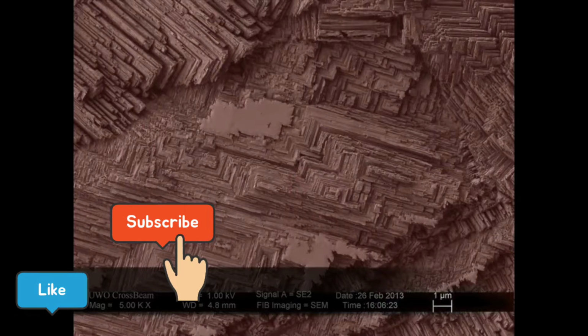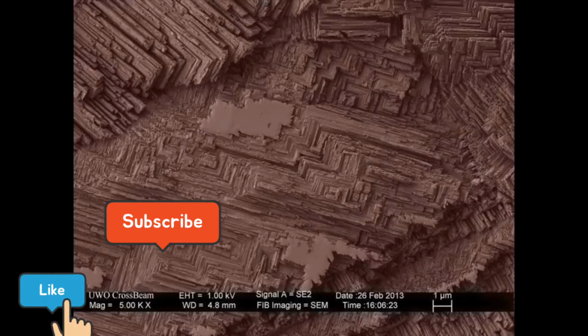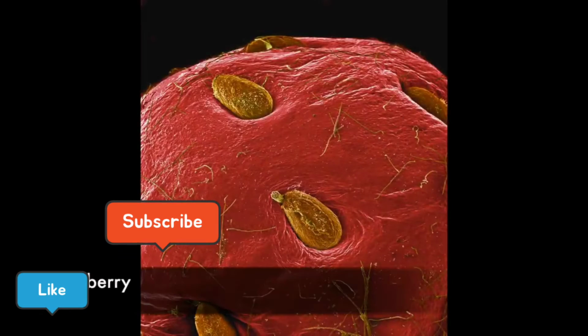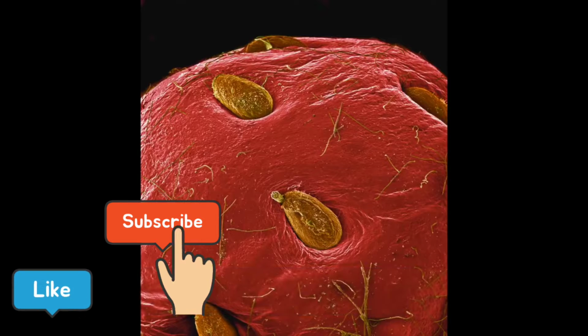The surface of an old used penny. The surface of a strawberry. The flesh of the strawberry is colored red. The seeds are the achenes.